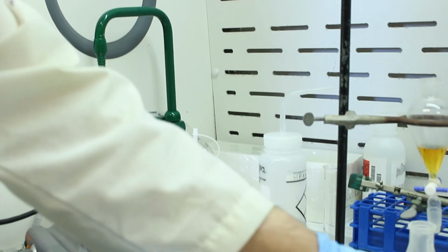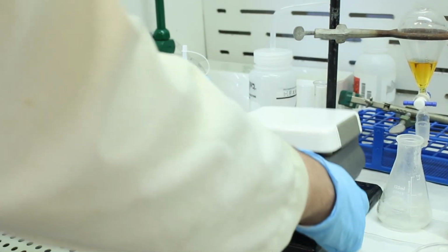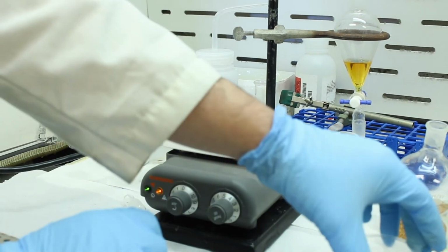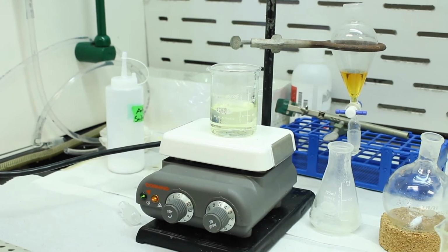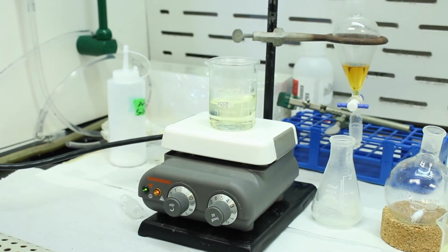So we'll take a hot plate here. Okay, so here's our hot plate. Turn it around about half and we'll place it on here. We're just going to be pretty careful when we do this because boiling off ether can be a little dangerous, so we'll be careful.